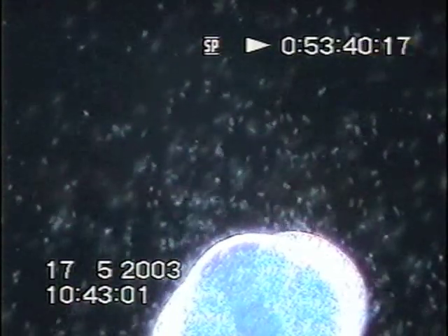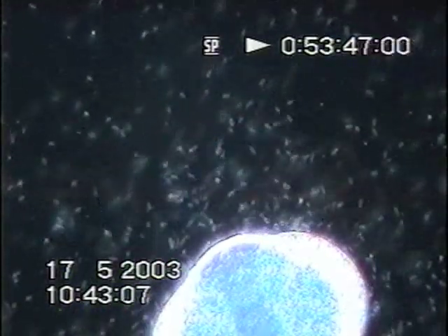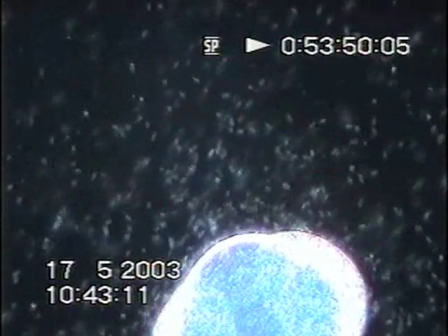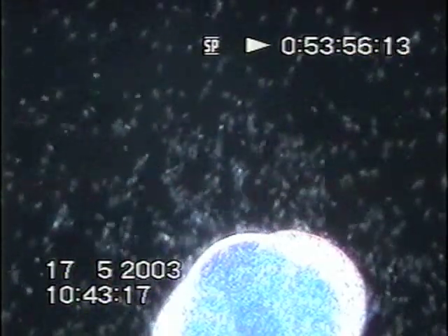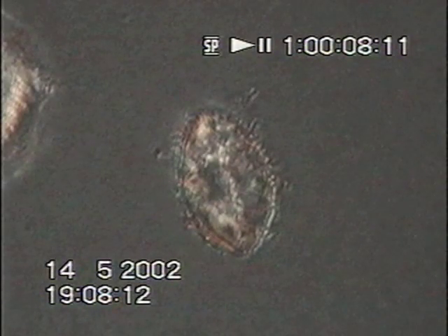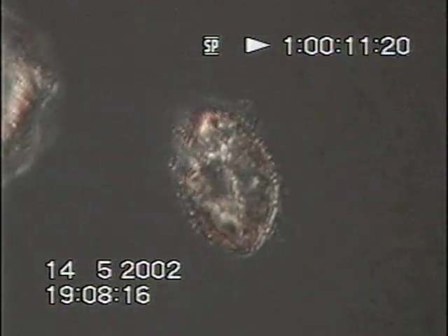Difficult to say. On a grain in the rainwater, we have an excellent view of the animalcules. They seem to be fighting over this prize, trying to eat it perhaps. Maybe they're getting some sustenance from it. Really quite a remarkable picture. And if we move it just a little, you can see, I'll demonstrate this as best I can.